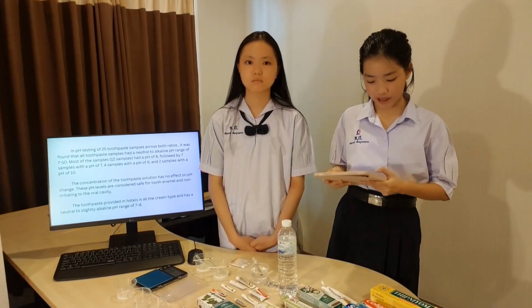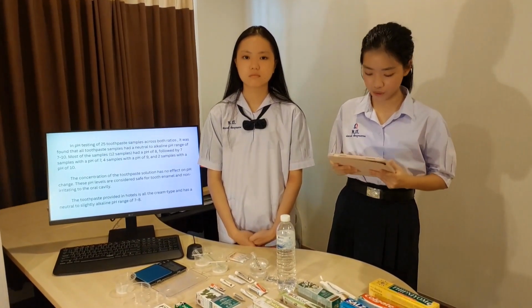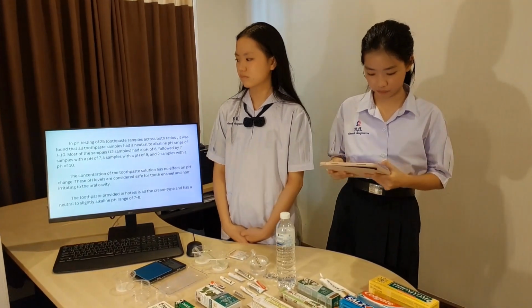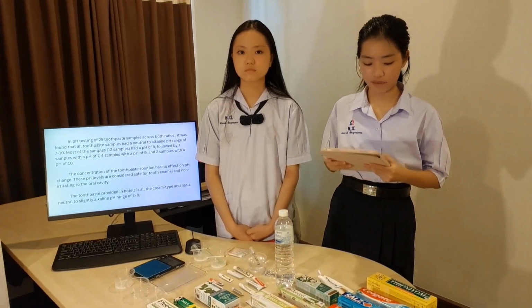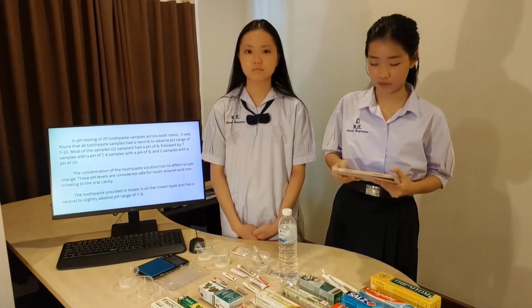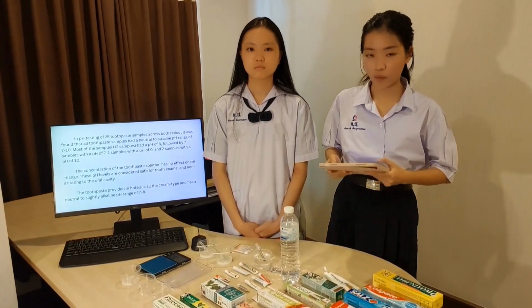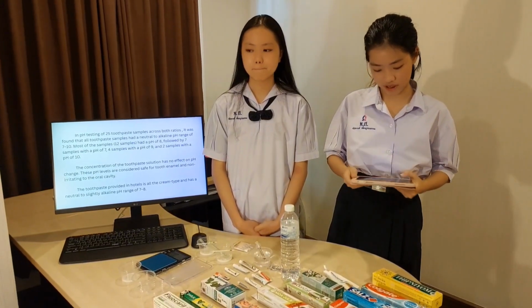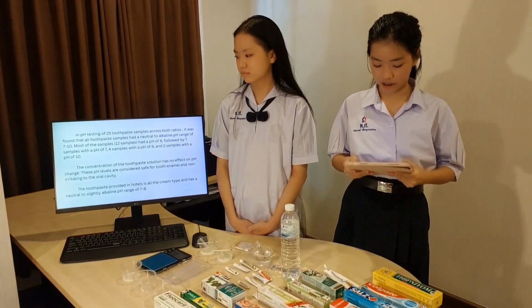In the pH testing of 25 toothpaste samples, across both ratios, we found that all toothpaste samples have a neutral to alkaline pH of 7 to 10. 12 samples have a pH of 8, followed by 7 samples with a pH of 7, 4 samples with a pH of 9, and 2 samples with a pH of 10. The concentration of the toothpaste solutions has no effect on pH change.